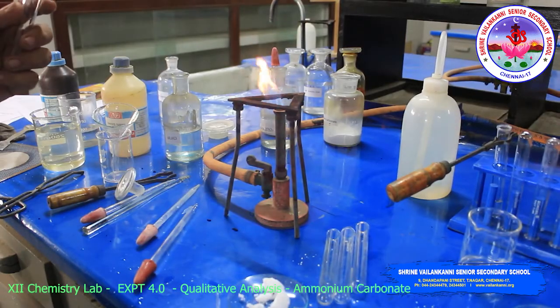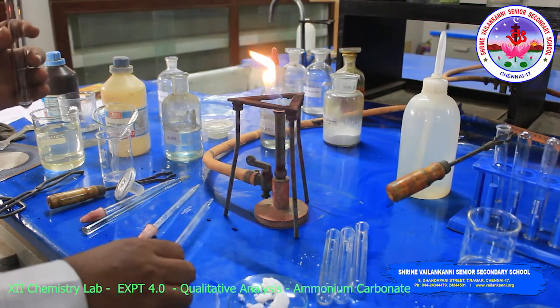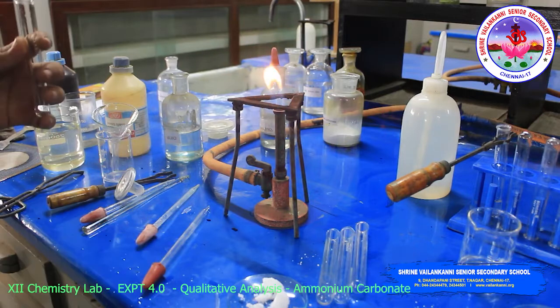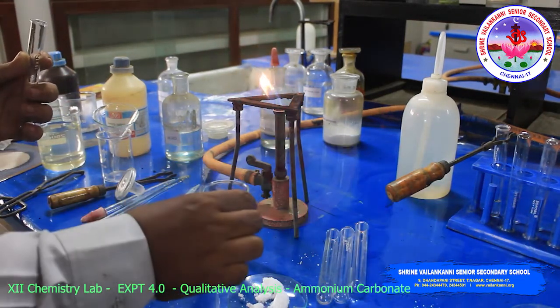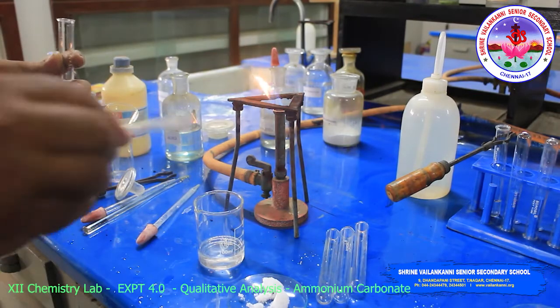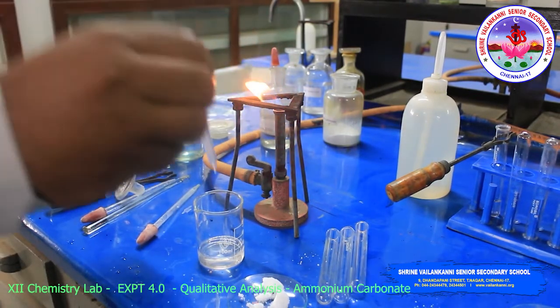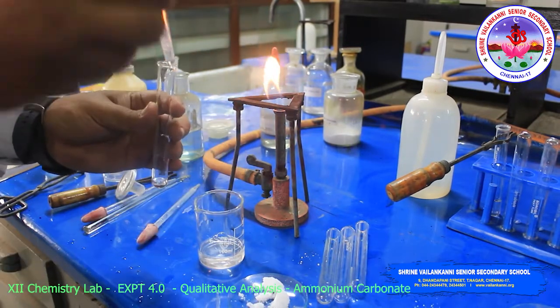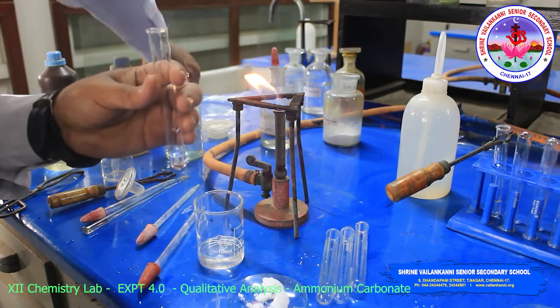If a sodium carbonate extract test is needed, there is also one test, that is the magnesium sulfate test. Already I prepared the sodium carbonate extract. Take a small amount of extract, then add magnesium sulfate solution.